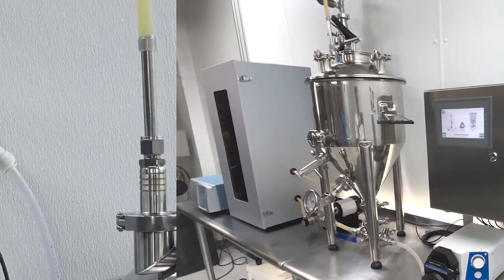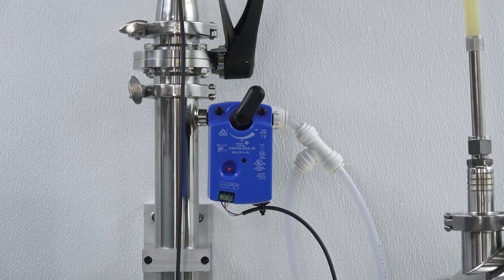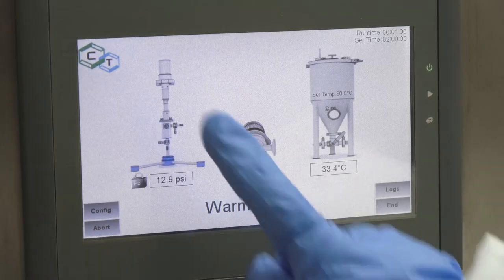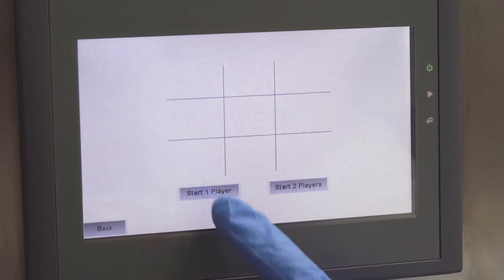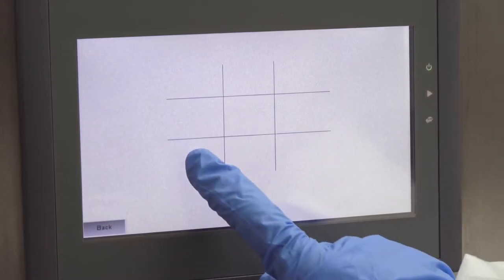When the batch temperature approaches the set temperature, the automation controller will adjust the cooling control valve to hold the emulsion at the set temperature for the remainder of the run. While the automation controller is hard at work processing your nano, you'll have time to sharpen your tic-tac-toe skills, with or without a partner.